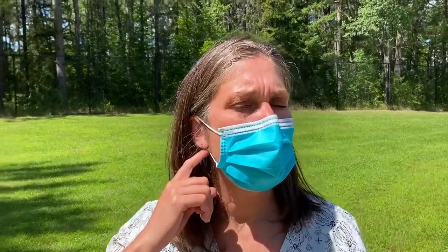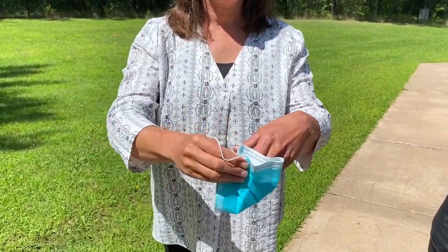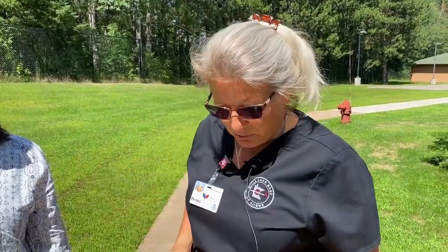When you're taking it off, just touch your strings to take it off. You potentially have germs on the inside of it, so you want to fold it to the inside and throw it in the garbage. You could wear a paper mask like that all day — you just don't want to wear it multiple days.